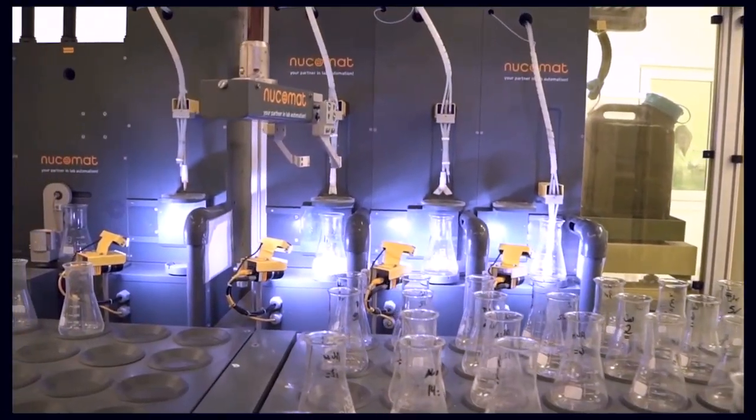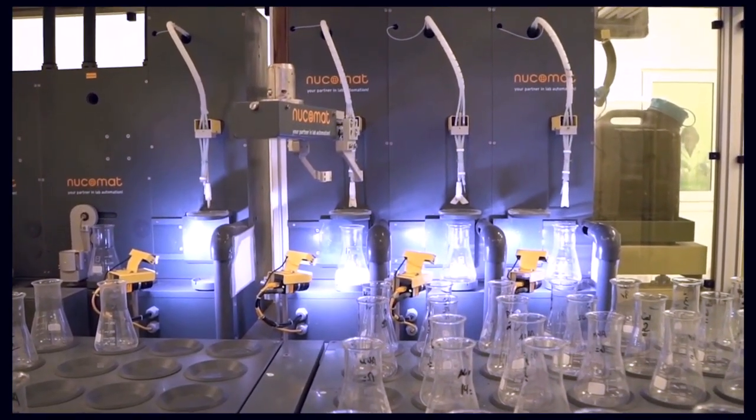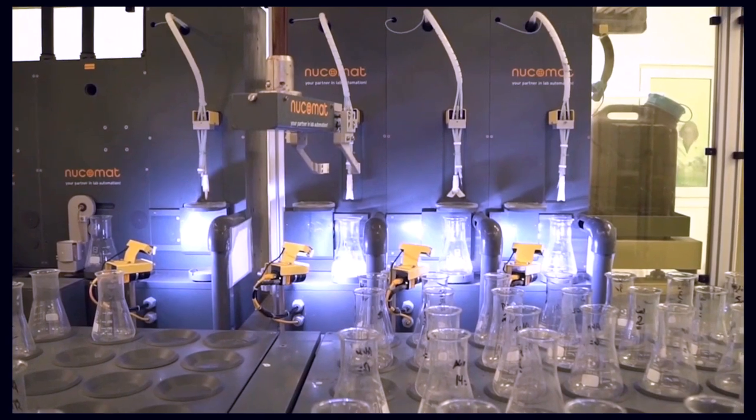After aqueous reconstitution with a precise mixture of ammonia, hydrofluoric acid, and acetic acid, the samples are transferred to the automated titration bench.